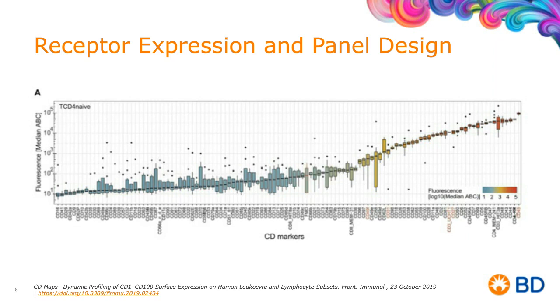Now that's all done in normal blood. So all bets are off, as we know, when we go to a disease process or an activation, things can change. But it's a starting point because it's great to know that a specific specificity may not be in a different cell, and that information helps us perhaps put the right color on the right specificity.